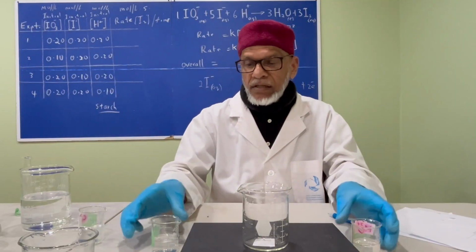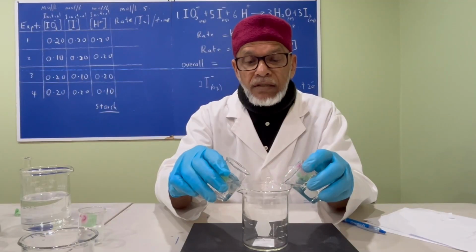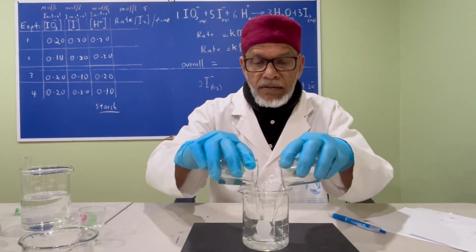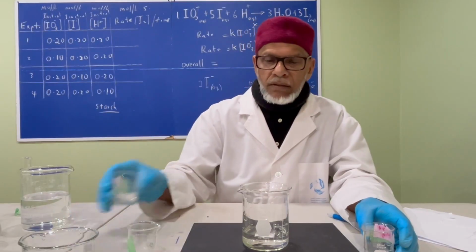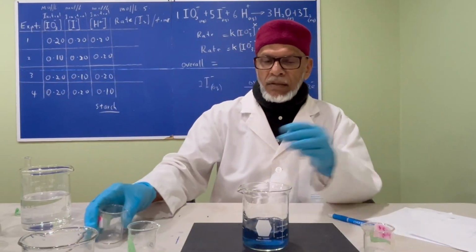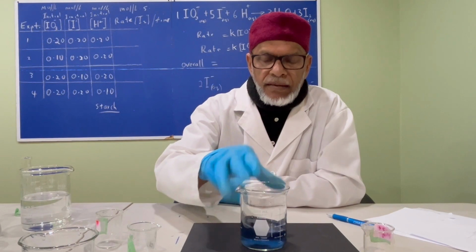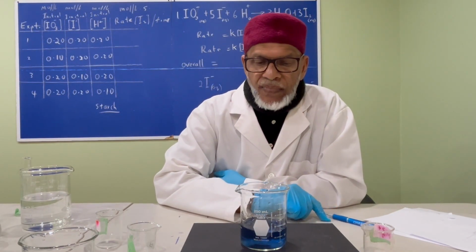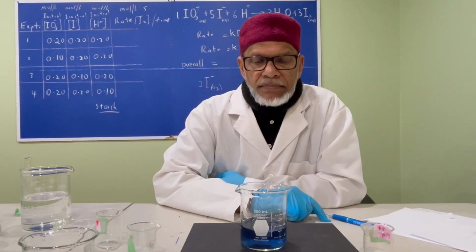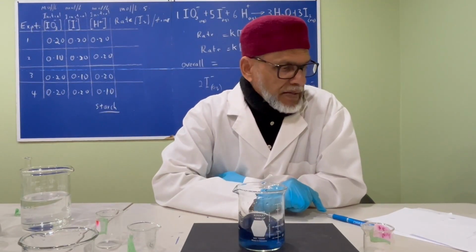So put one aside there. It's on the stop clock, and we look at the time for that thing to disappear. Okay, here we go. Sorry, we're a few seconds off there. Okay, no problem. Give it a little bit of swirl if we didn't do that.